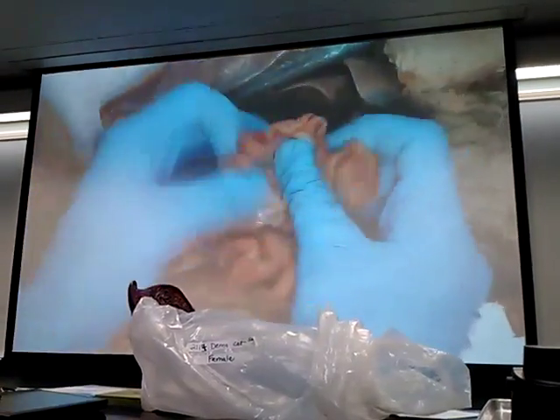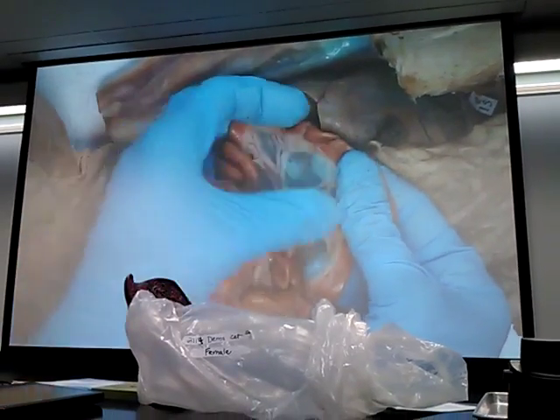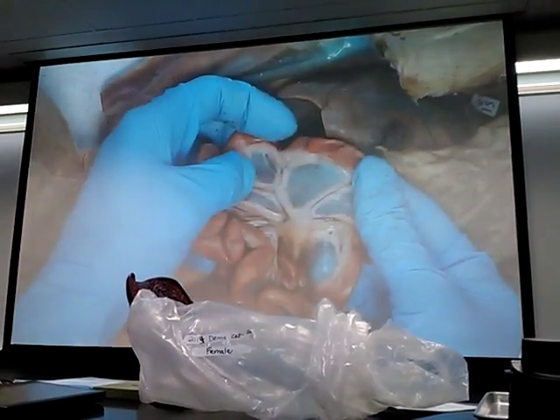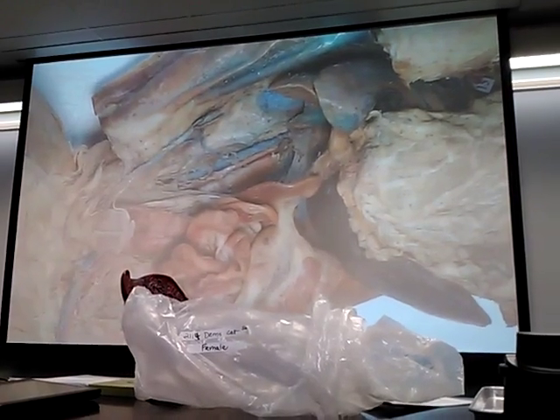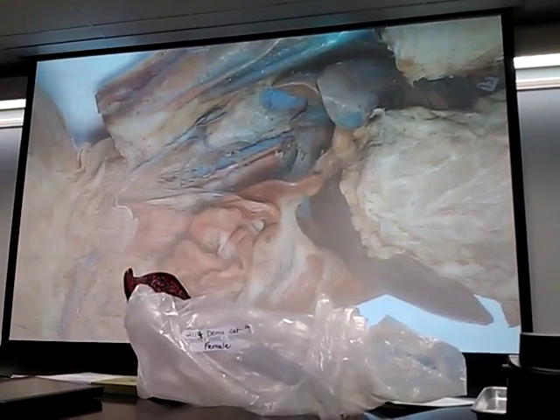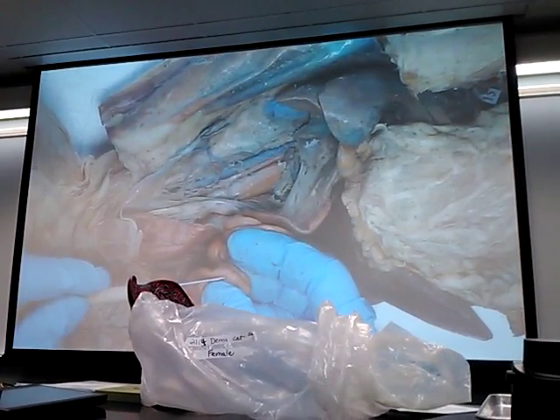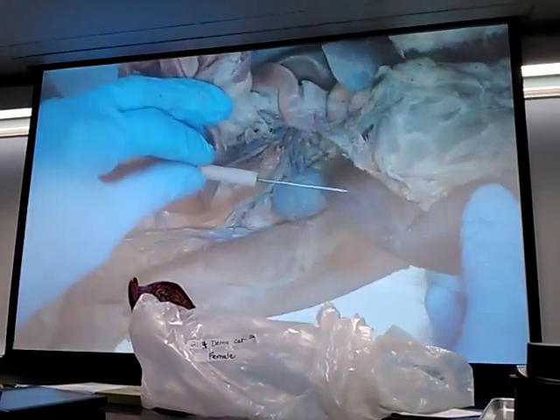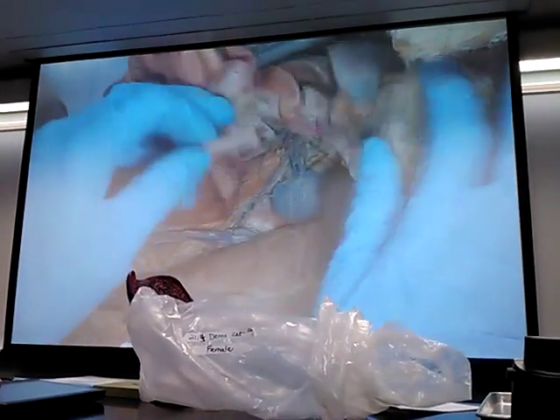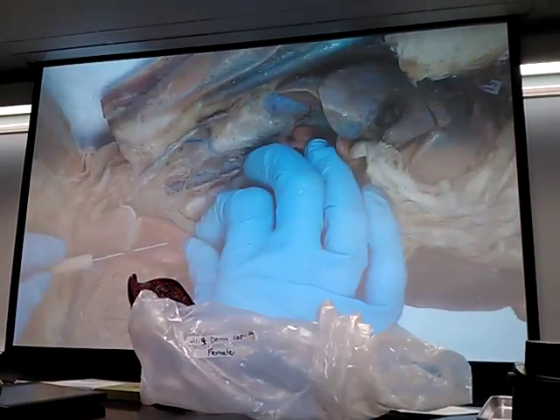Mesentery, that's this thin stuff between the intestine. So this is mesentery. Visceral peritoneum. For testing the visceral peritoneum, I would stick the pin right through a thin outer layer of the intestine, or the stomach, or the spleen, or the liver, or the large intestine.